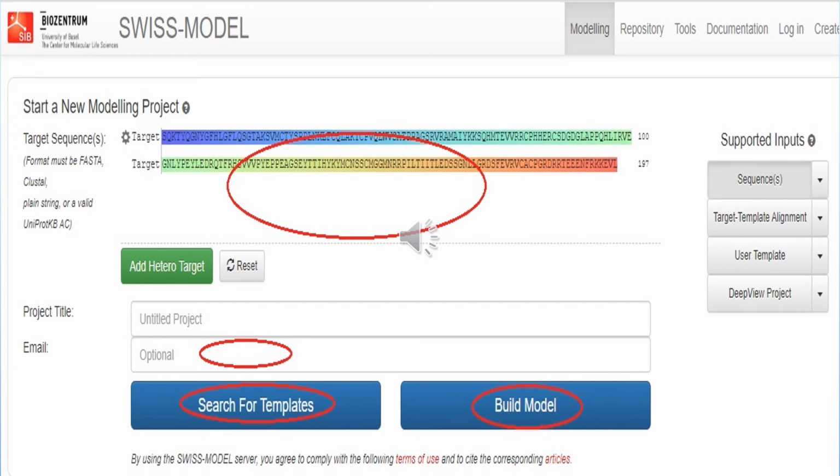Thirdly, model building, and in the fourth step, model quality evaluation. These steps require specialized software and integrated up-to-date protein sequence and structure databases. Each of the above steps can be repeated interactively until a satisfying modeling result is achieved. So if you are not satisfied with your model, you can do it many times.